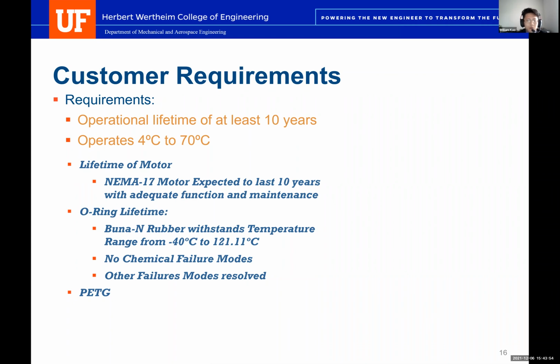Some other failure modes are resolved with even surface finish with lubricant. There's low pressure suction, so high pressure failure is no problem. And there's the use of double O-rings for better seal. Careful installation is also advised to prevent installation damage.